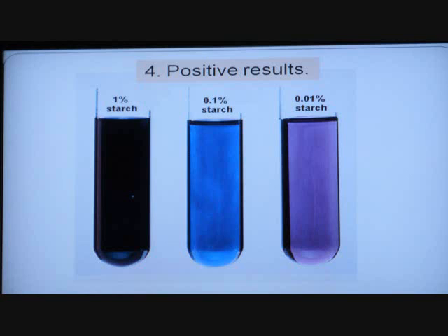If I'm discussing Biuret, that's a nice, strong, positive stain for proteins. If I'm discussing iodine, that's a weak stain for starches. I can't show you a test tube and say, what stain was it? Unless I say, give me all the options. Like I just told you. You can say, well, if that was Biuret, that last one over here, that'd be a nice, strong indicator for proteins. However, if that was iodine you're using, that's a pretty weak indicator for starch. It would depend on what stain you use.